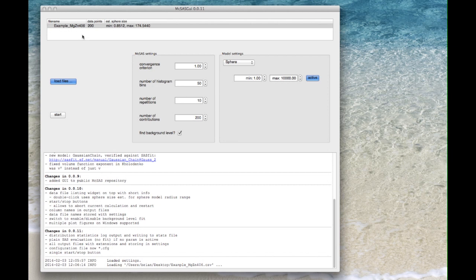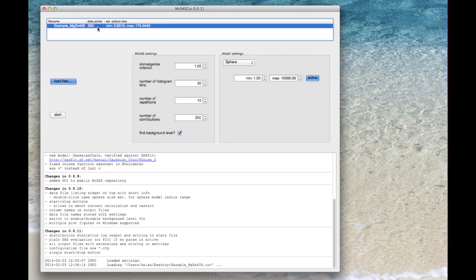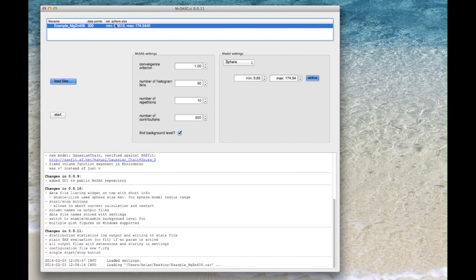It's in this list. We see the number of data points as well and we see an estimate for the minimum and maximum size if we have spheres. So if I double click this line the sphere size estimates get transported to the model settings over here.